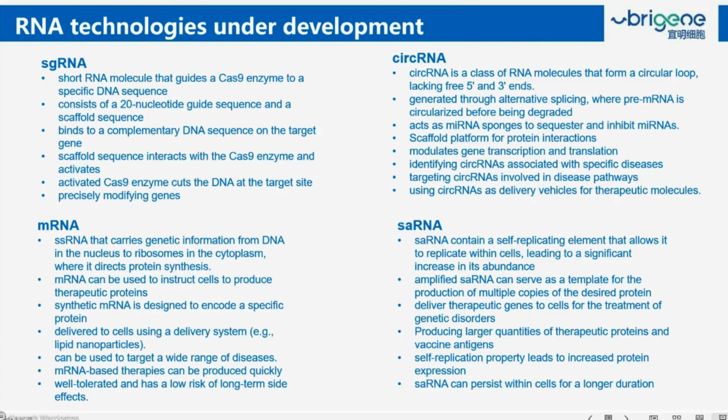This is a wordy slide. You'll be able to access this through our website if you want to revisit it. I just wanted to cover at a high level the 101 part of RNA forms. We'll start with small guide RNA, obviously an area of exciting developments.